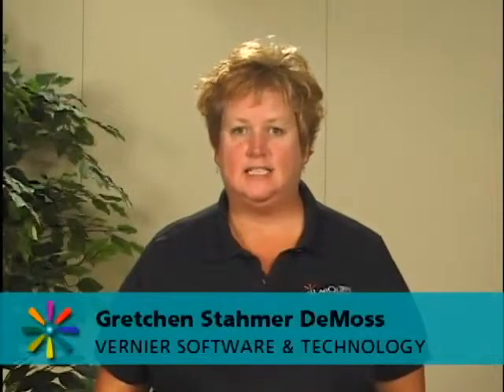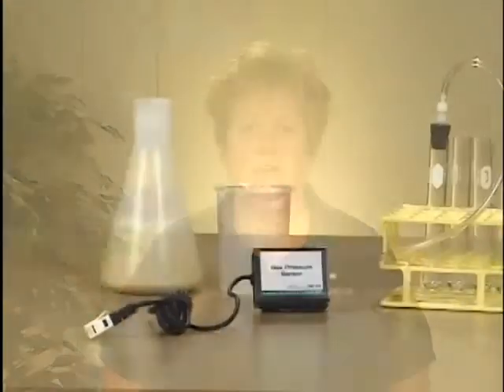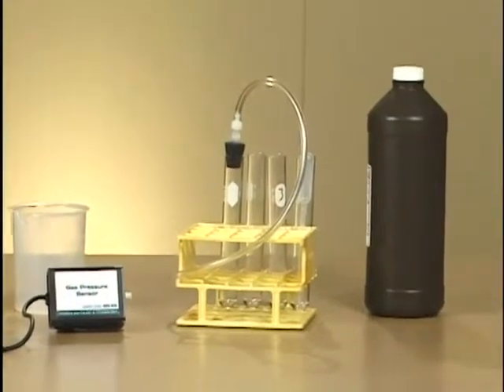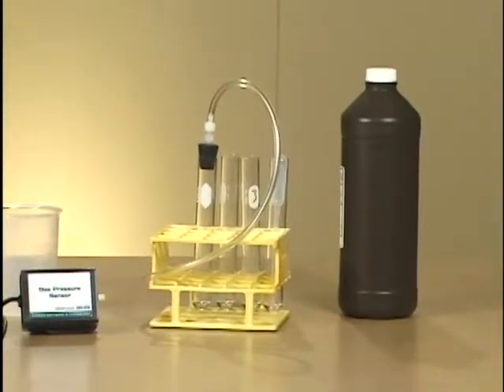This is the Enzyme Action: Testing Catalase Activity lab from the Biology with Vernier and the Advanced Biology with Vernier lab manuals. This is a very popular lab for general biology and is one of the required labs for AP Biology.